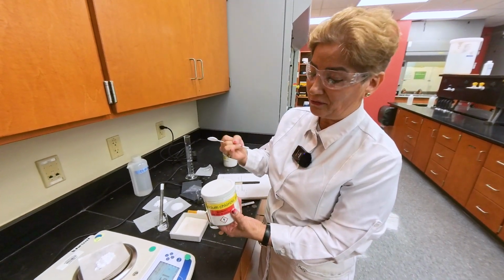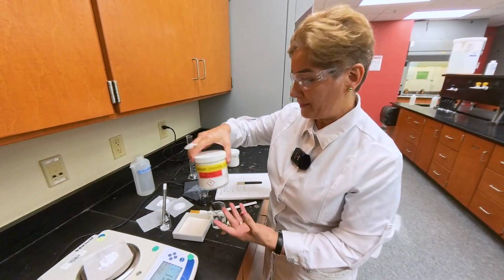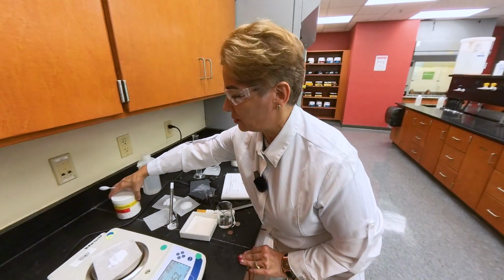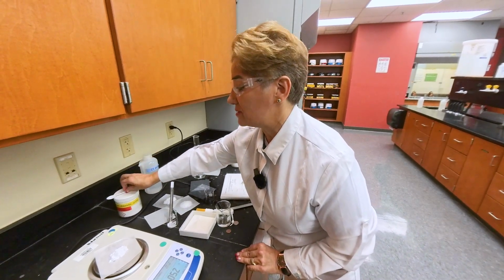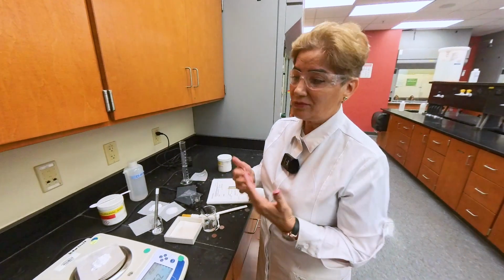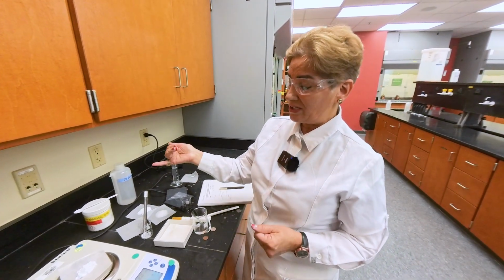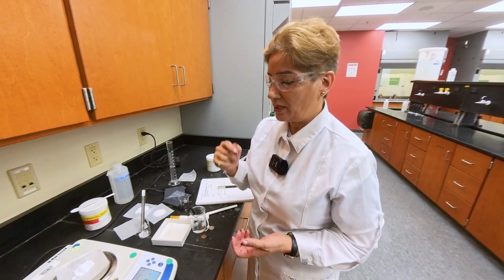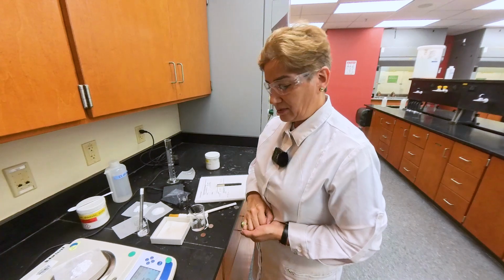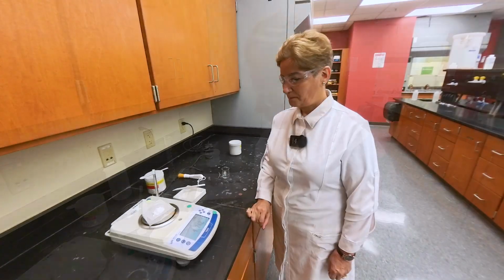And it's not going to be efficient whenever we need to use it as an anhydrous agent to absorb water from any oil or organic liquid that is not water soluble. You will learn the technique later how to use it, but at this point, anhydrous agent like calcium chloride is going to absorb moisture from the air and the mass is going to increase. We are going to wait for this 15 minutes and we come back.